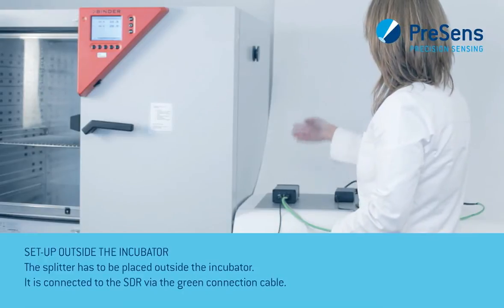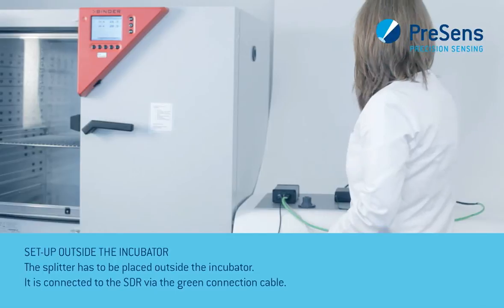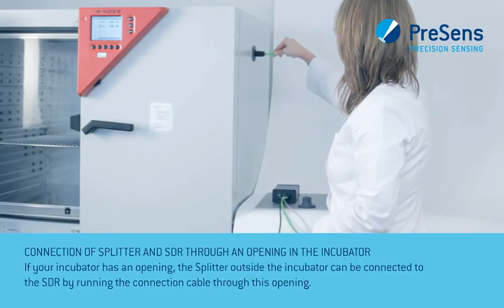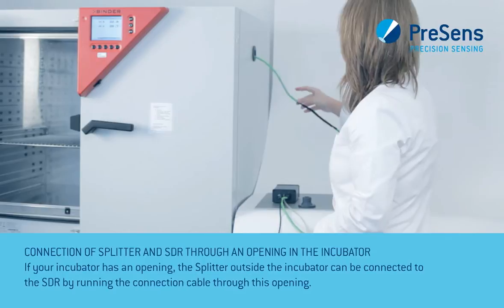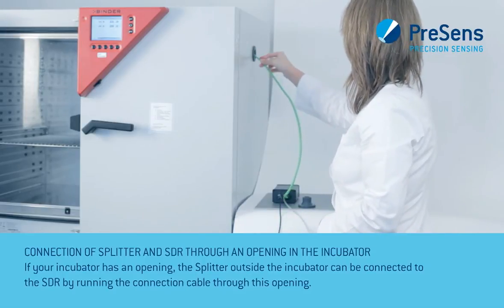The splitter has to be placed outside the incubator. It is connected to the SDR via the green connection cable. If your incubator has an opening, the splitter outside the incubator can be connected to the SDR by running the connection cable through this opening.